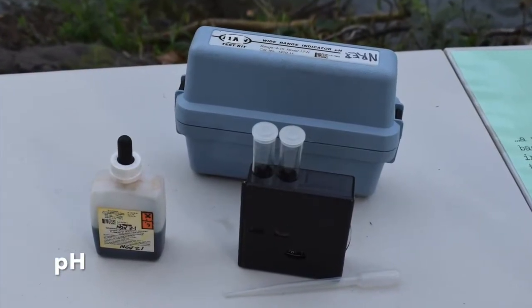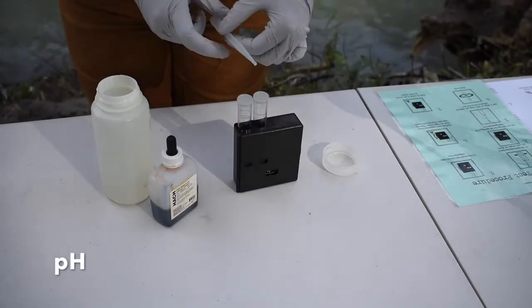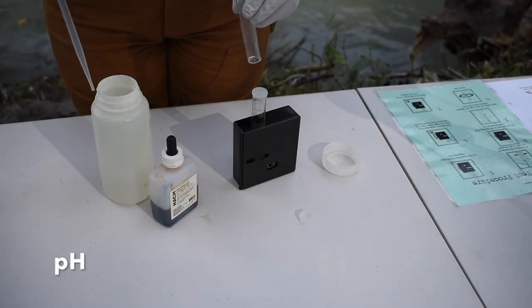Here are all of the materials you will need to do this test. The first step is to fill each of the two tubes with 5 ml of sample water from the river.